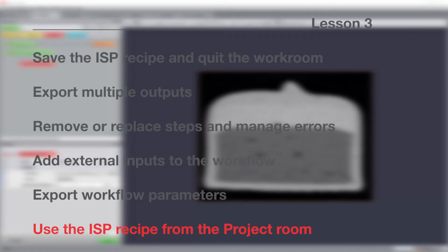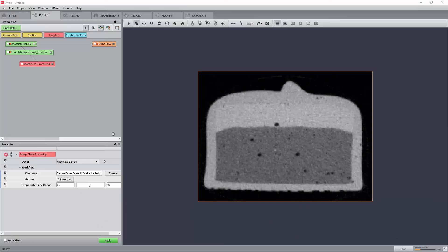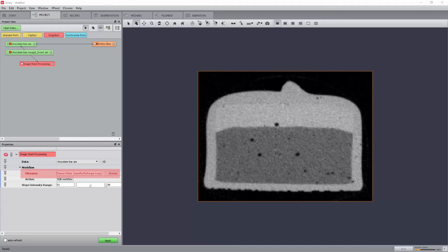Finally, we will apply a saved workflow to a 3D dataset processed as a stack of images from the project room using the image stack processing module. For the tutorial, we will apply the workflow that we created to the full dataset. At this stage, the image stack processing module attached to the chocolate bar data should point to the .hxisp file we have saved on disk.